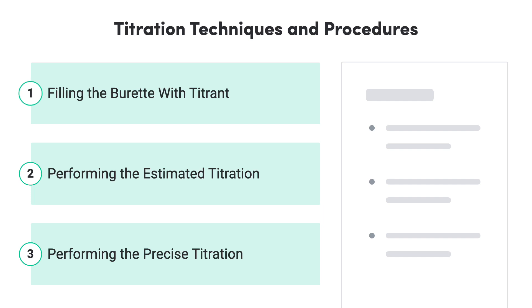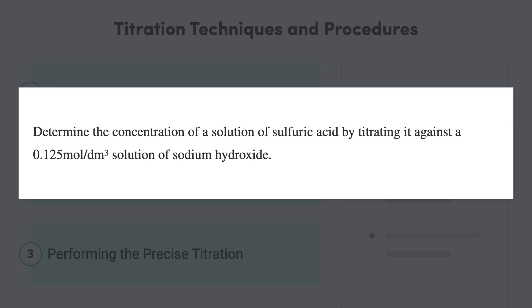This requires us to firstly fill the volumetric equipment accurately, perform an estimated titration, and then perform three rounds of a precise titration. In this particular example we've been asked to determine the concentration of a solution of sulfuric acid by titrating it against a 0.125 molar standard solution of sodium hydroxide. So let's chuck our safety glasses on and get into it.